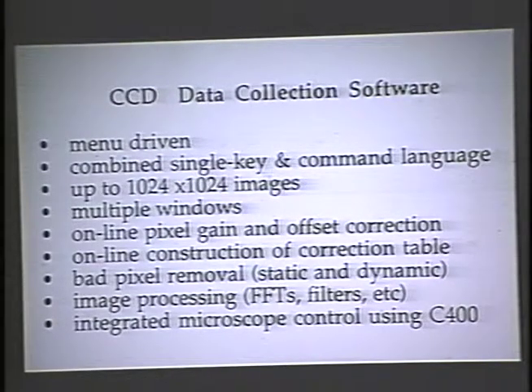This is very nice, for example, to take a picture. All you do is raise a screen like you normally would to take a picture, and you hit G on the keyboard instead of pushing the button on the microscope. That's all it takes, and an image comes up, and now you have it directly recorded digitally, and if you want, stored on a disk.